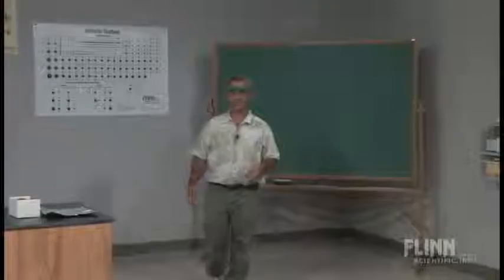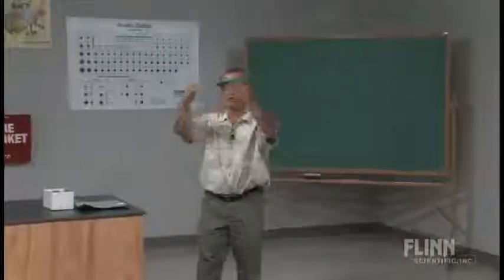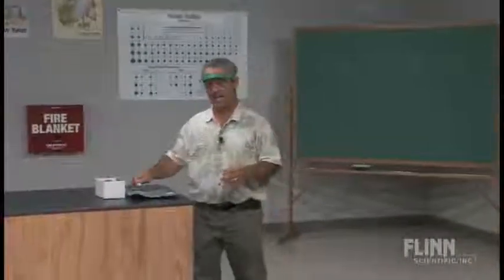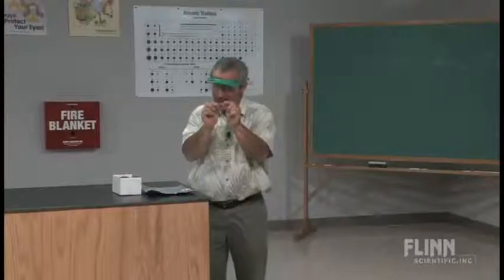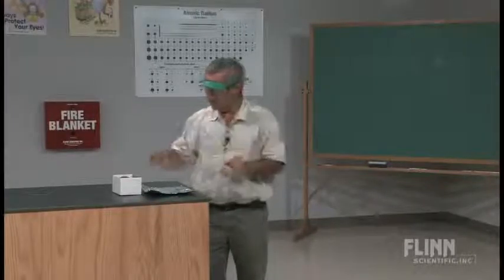Now I've seen that done in the chemistry lab too, and it sends sparks everywhere, and it's quite impressive. This one I think is even more impressive because I'm going to be holding onto it with my hands, and it's going to happen at a very small scale.